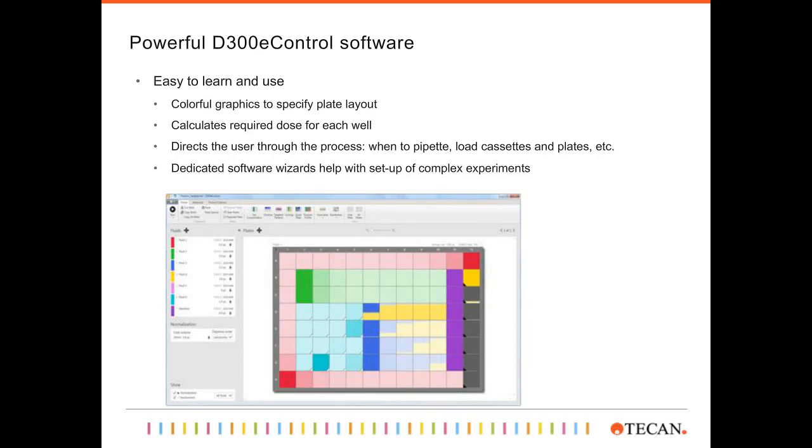What you see here is also a color representation of a couple of different possibilities of dilution series, a randomized dilution series, and also a synergy experiment, a drug-drug interaction study. You can have duplicates. The black fill of the wells indicates that it has been normalized or backfilled with the diluent, to make sure that you're not looking at an effect of DMSO or whatever diluent your compound is dissolved in. Also, you can add control wells or have replicates of your experiments.